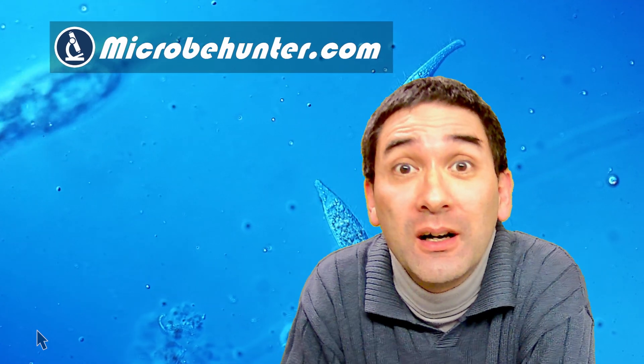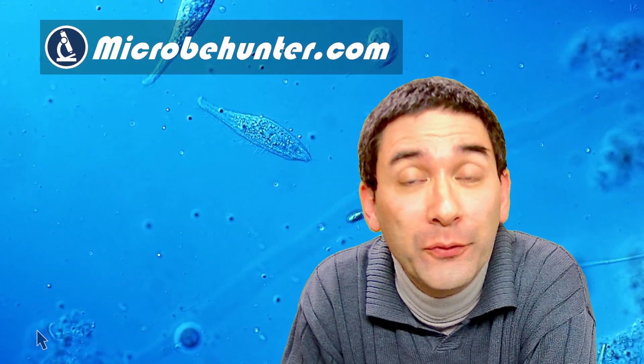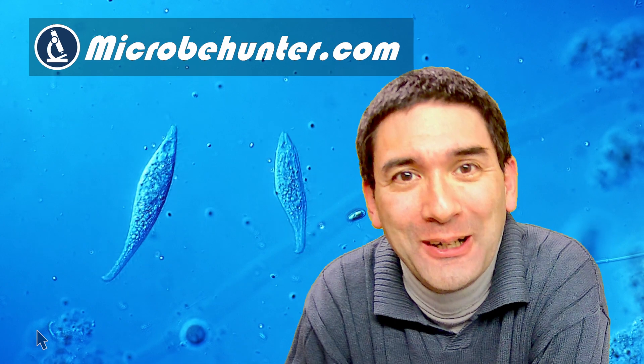Hi, hello and welcome. Microbe Hunter here. Short video today. I would like to show you Amphileptus and how it is hunting for some food. Actually a quite spectacular little video clip that I'm going to show you today.